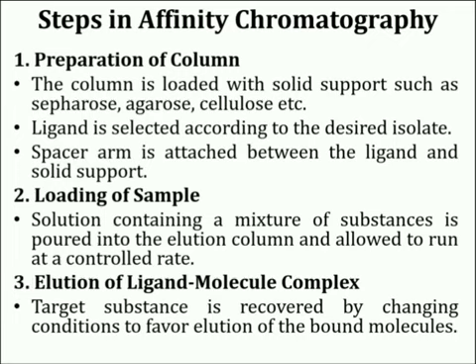In the last step, target substance is recovered by changing conditions to favor elution of the bound molecules. This is usually done by using a competitive ligand or non-specifically by changing the pH, ionic strength or polarity. Target protein is collected in a purified, concentrated form.